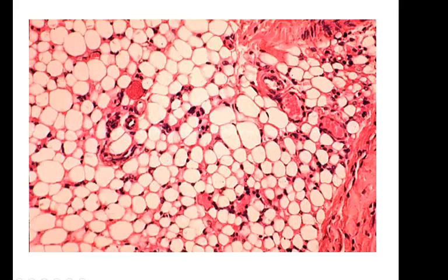So if you want to go back to chapter 2 and remember what triglycerides are, those are a glycerol head with 3 fatty acid tails, and it's our main storage form of fat. So here's an adipocyte, and adipocyte is our name for our fat cells. So each one of these are fat cells, and we store these right underneath our skin. That's one place that we store these. We call that subcutaneous storage of fat, and it's a big fuel reserve. That's what fat is. It's our fuel reserve.